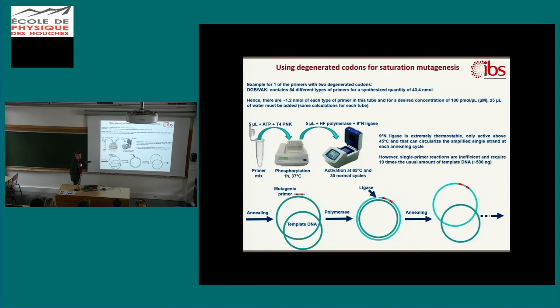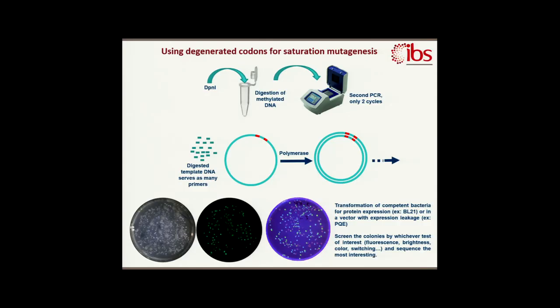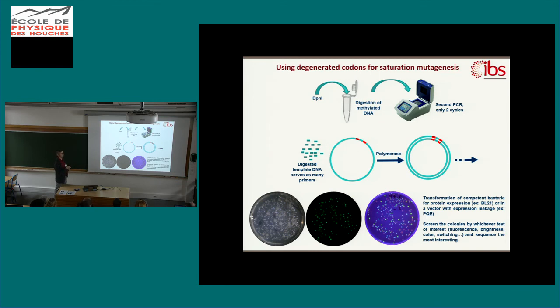But then you have to generate the other one, no problem. You take your tube out of the PCR machine, you put DpnI, which only cleaves methylated DNA, meaning your template DNA, not the one generated by the PCR. You digest it, and all these little pieces of the template DNA will serve as many primers. And there's very, very few chances to regenerate the mutated templates. So you will generate the corresponding other mutated strand, and eventually you'll have all your mutants at once that you'll need to plate.